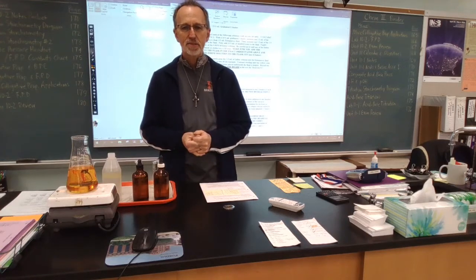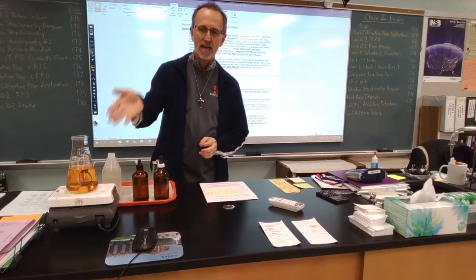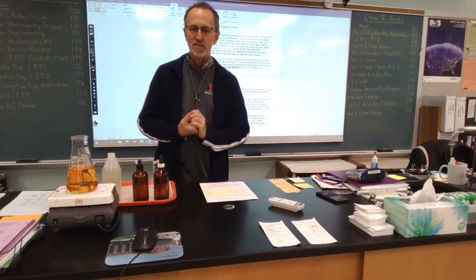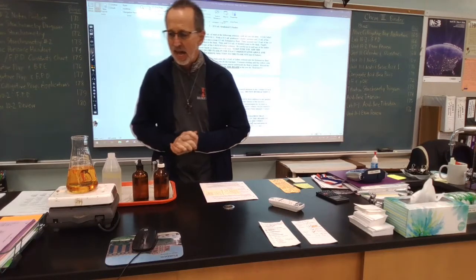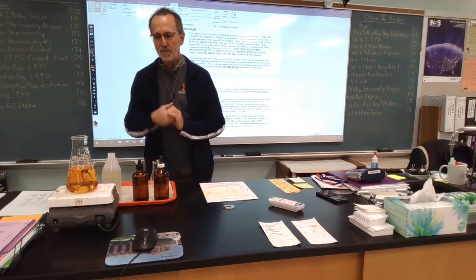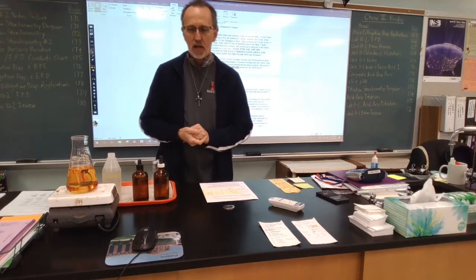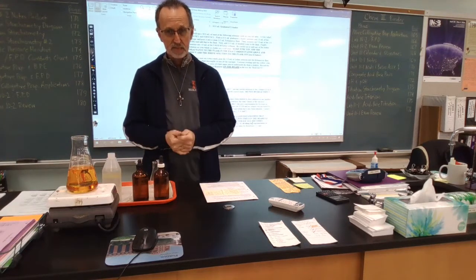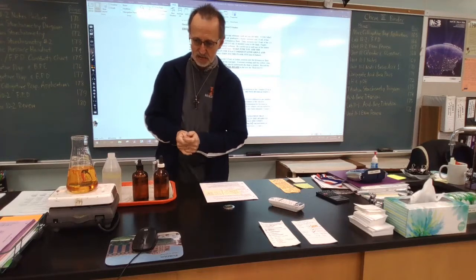Believe it or not, when I got here this morning at 6, I put the iodine in water and started swirling it, and I still see iodine at the bottom. It's not very soluble.